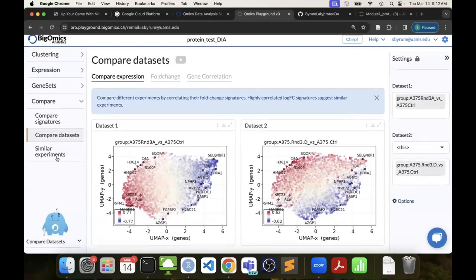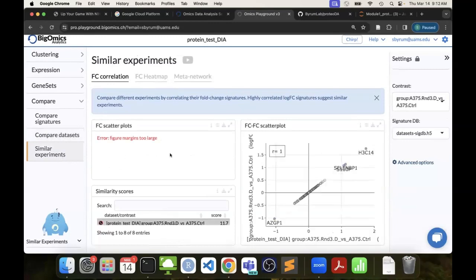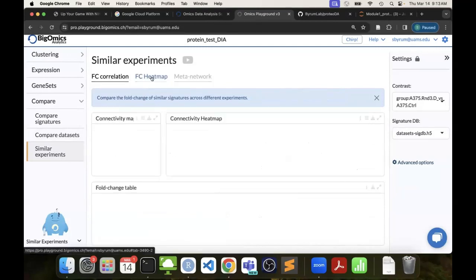So there's a lot that I can't cover in here because when I met with the guy, I went over all the different features. That was a 2-hour meeting. We don't have a 2-hour meeting. So there's quite a lot of power within this software. And they're continuing to build more. It is a fairly new, young company. So they're really happy that I'm giving them free advertisement. So just wanted to mention that one.